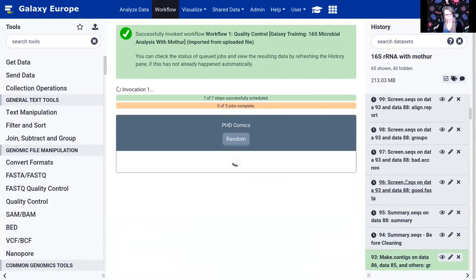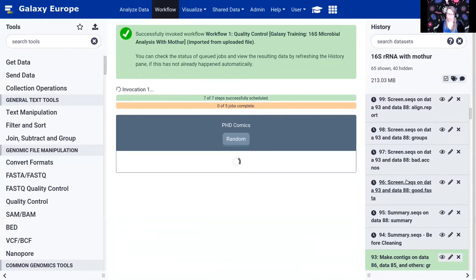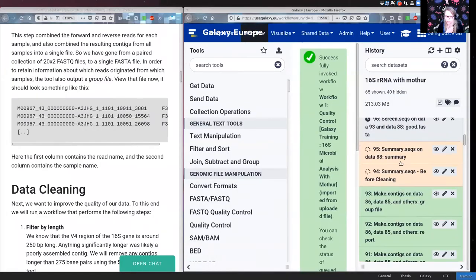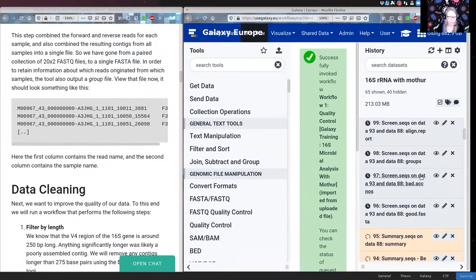If things stay grey for a long time, the server is probably busy — that's fine if many people are using Galaxy at the same time, you may just need to wait a bit. In Galaxy you can always already schedule the next step even if the previous one hasn't finished yet.